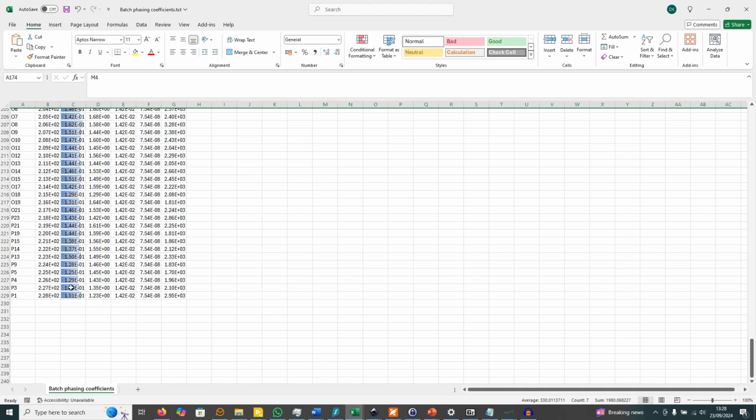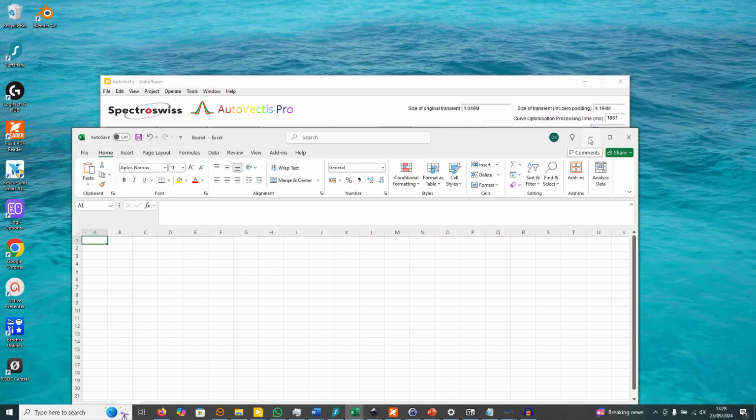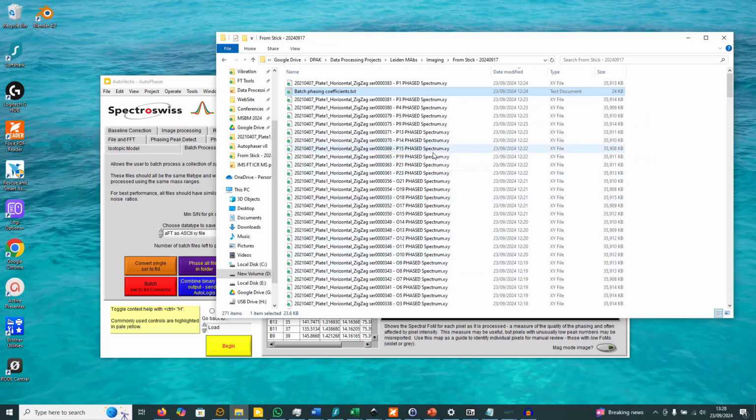But they still seem relatively close to the ones on top, so I don't think there's any particular issues here. And yes, as you saw in the folder, all the XY files are here, and these are the ones that you'll need to import into your downstream process.